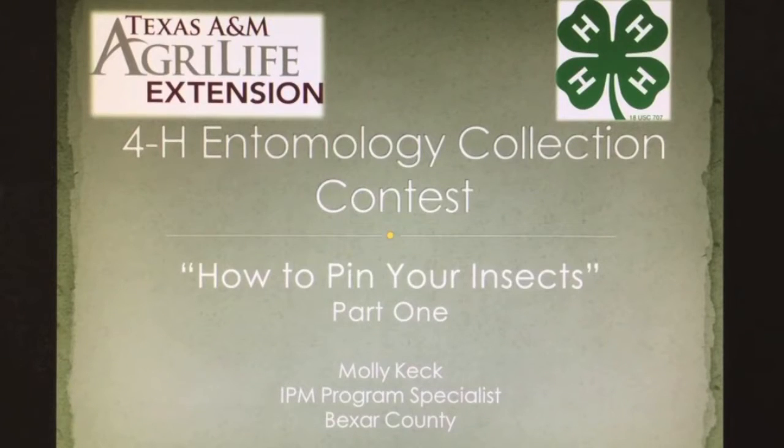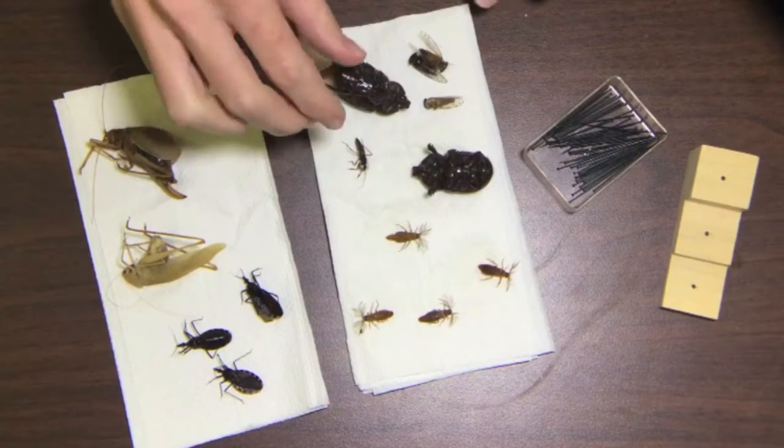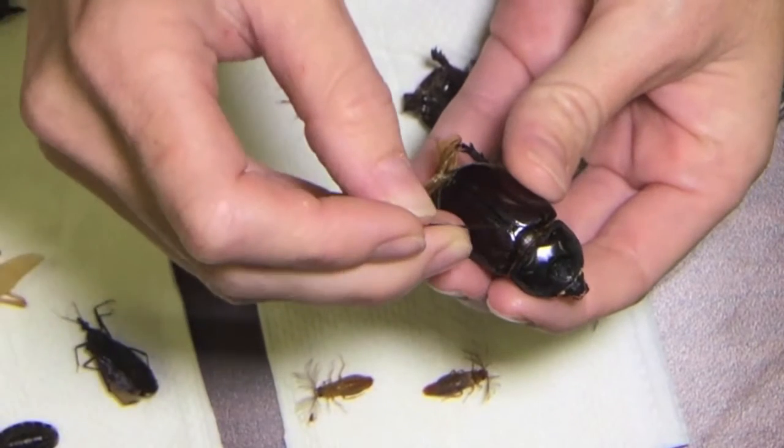This is a video on how to properly pin your insects for your 4-H entomology collection. You have your collection of insects. Most insects are pinned through the thorax, but on beetles you pin them through the wing.